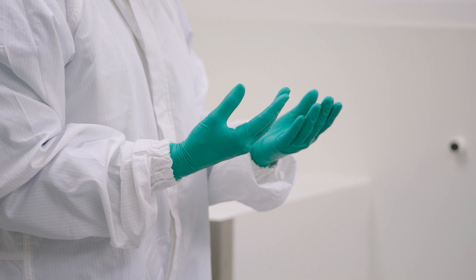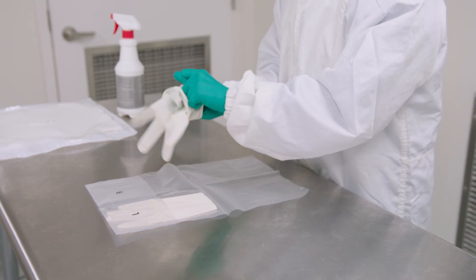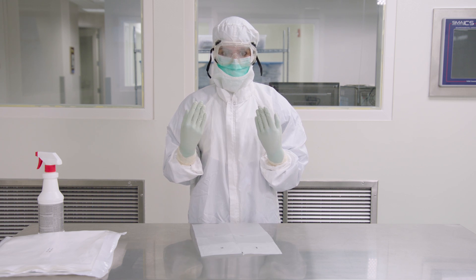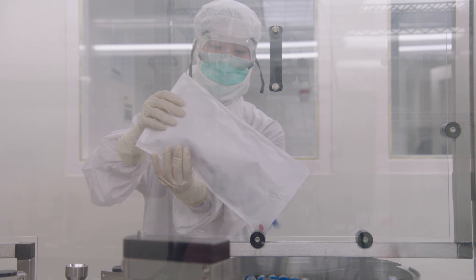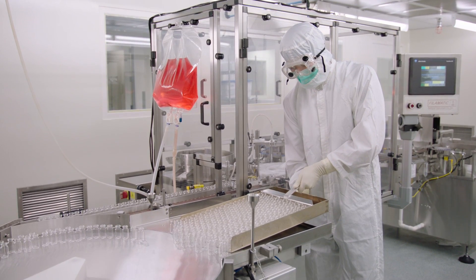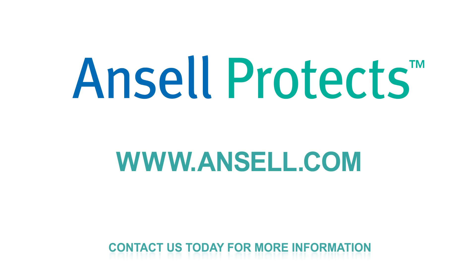Wearing a darker colored glove on the inside and a lighter colored glove on the outside is often recommended so that you can see if there is a puncture or tear in your outer glove. By using proper donning and doffing techniques, you help protect your safety as well as the integrity of the products you're working with. Contact us today for more information and a free glove sample at Ansel.com.